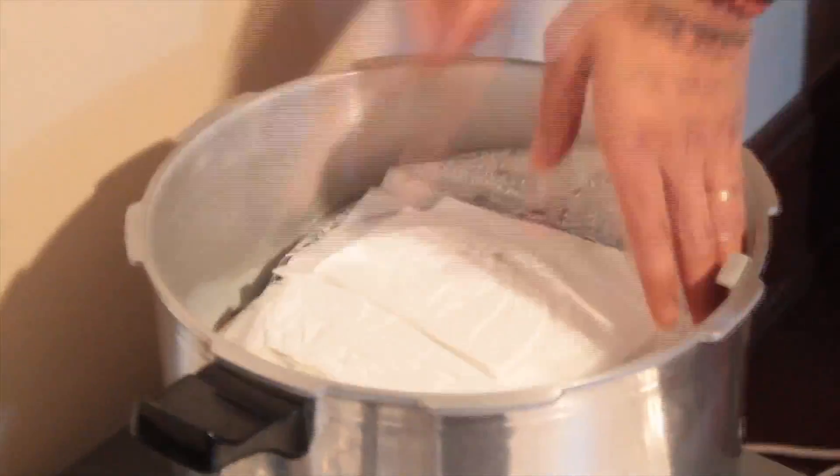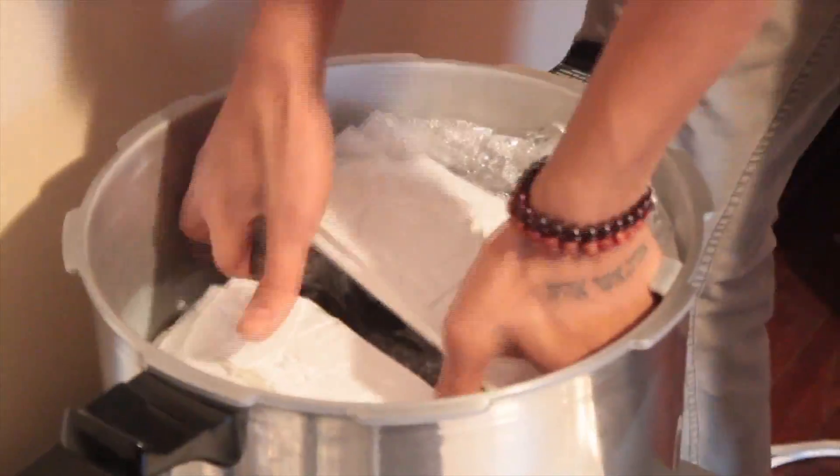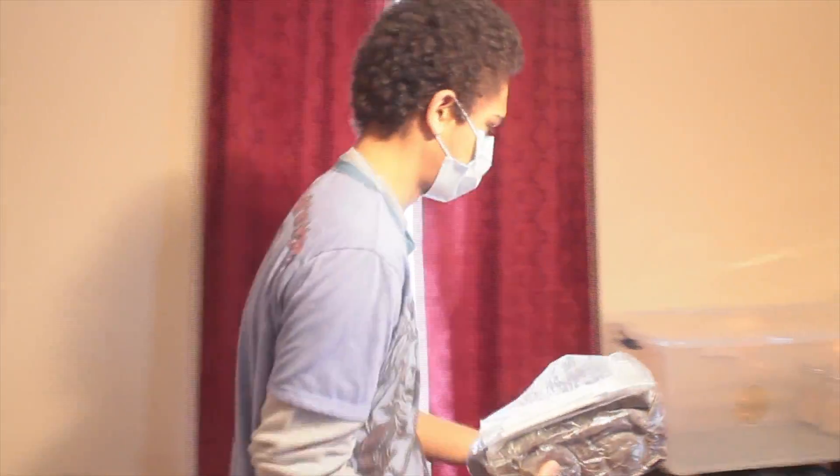So we have our bags in our pressure sterilizer over here. They haven't been opened since they've been sterilized. It's sealed itself up in there. So we're just going to dry these off on the outside and then introduce our reishi spawn.